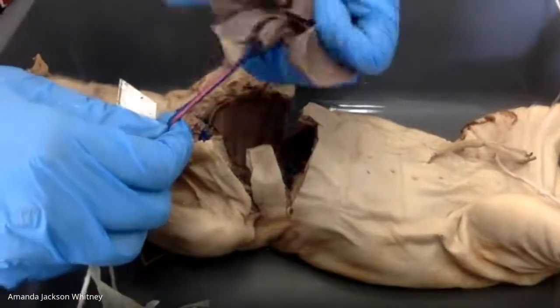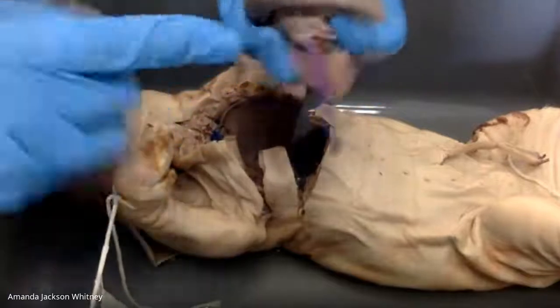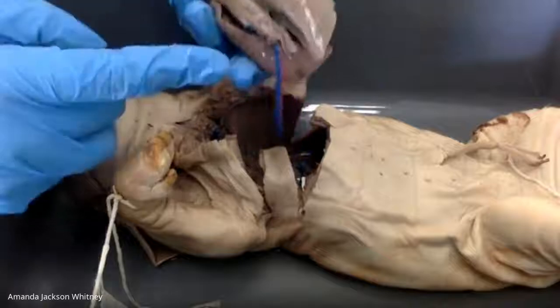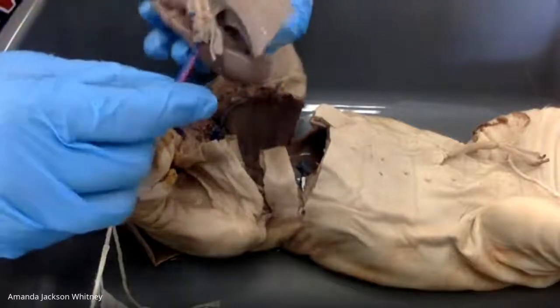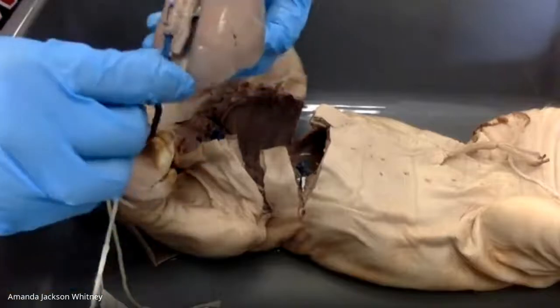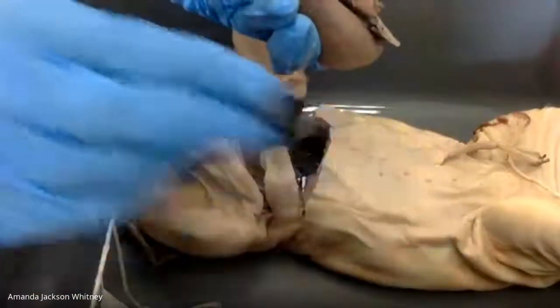That was just coming out of the aorta. That's where there's a little bit of pink there. We tried, kind of. So the aorta is running on the dorsal side of the lungs from the heart. So yeah, here is the aorta. I could pull the latex out of there. Woo! Very cool. That was really satisfying. I know, wasn't it? Ooh, I could pull that out too. Yeah. Oh, there we go.